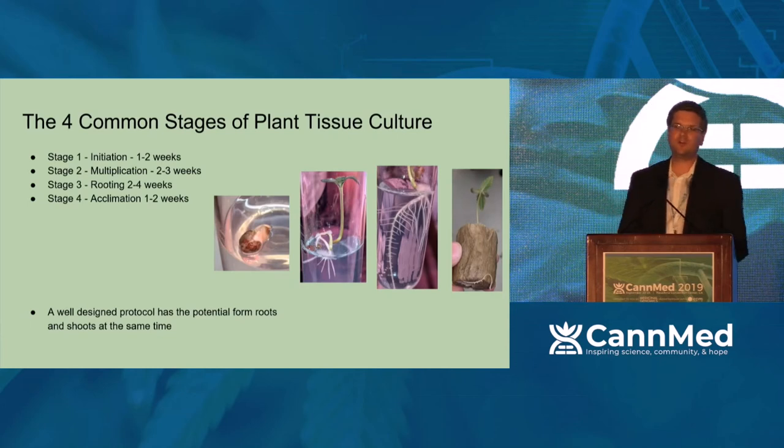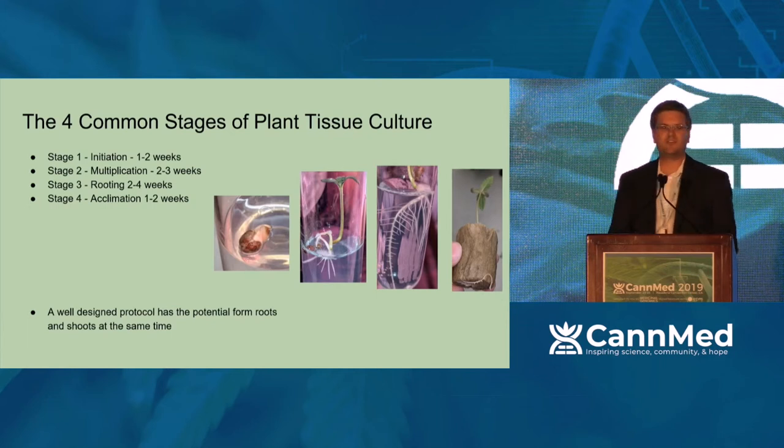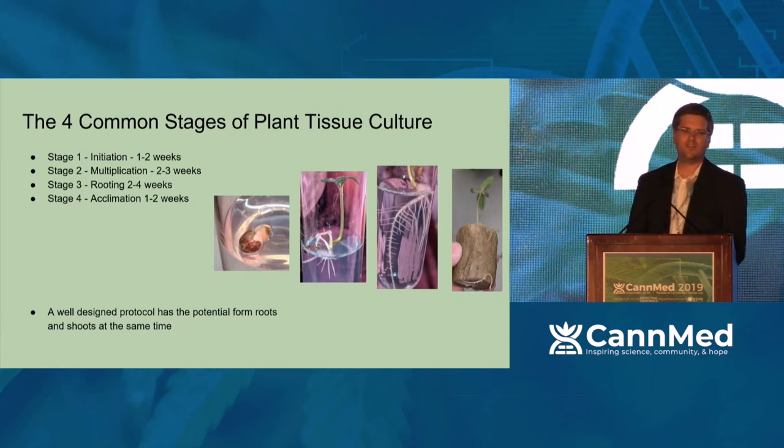There are four common stages to tissue culture, and I'm just going to summarize these because they're in all the literature, essentially. You have your stage one initiation. It takes about 2 weeks for almost every one of these stages. Your stage two, which is your multiplication, you're trying to mass your cells. Stage three, you get the plant to root once the stems have grown and your cells have massed. And then stage four, your acclimation stage, where you go and you harden it off.